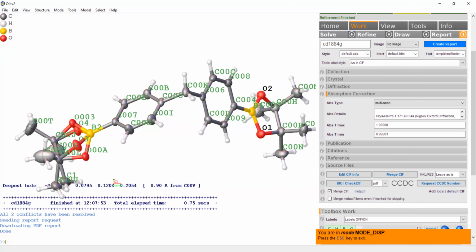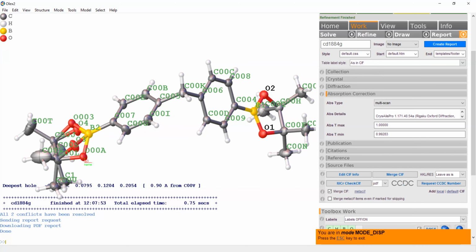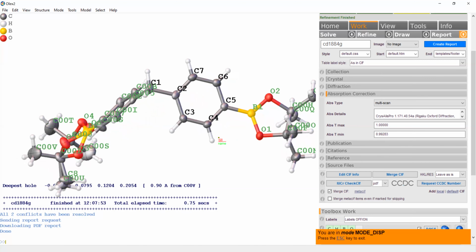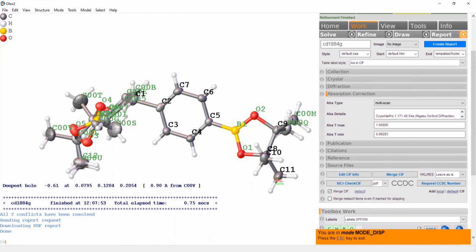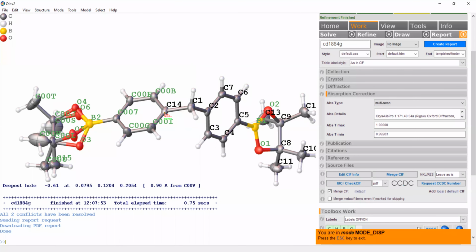Now for the disordered oxygens, just label one. So this is going to be O3 and that's O4. We'll label the other ones in just a moment. And then we do for the carbon, I'll start here, C1, C2, and so forth. I'd like to label the non-disordered side first and then work on the disordered side. So again, when you're labeling, there should be some type of organization and pattern to your labeling scheme.